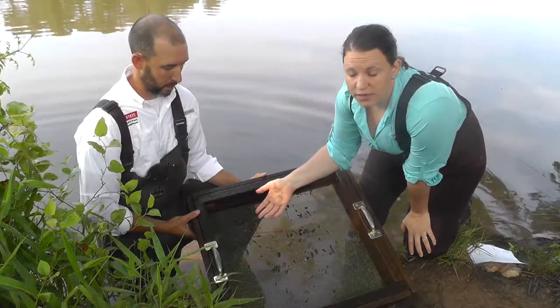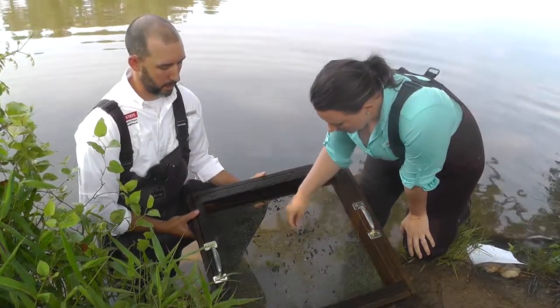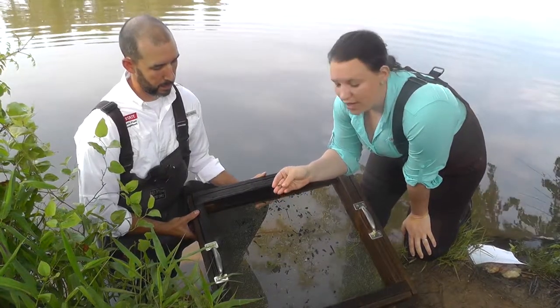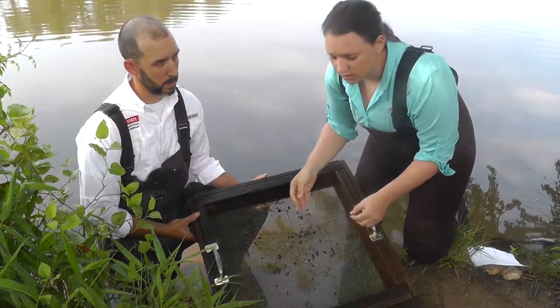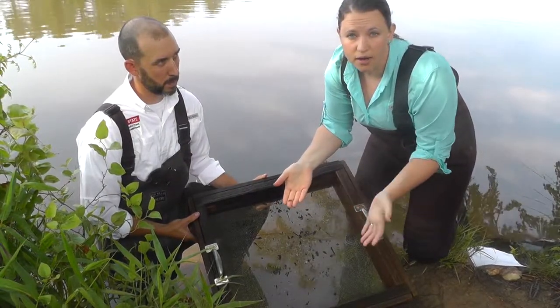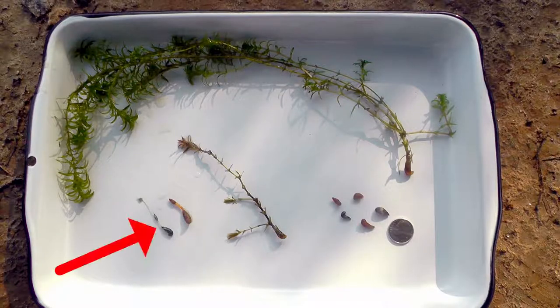Now that you've sieved through your sediment core, you can look for tubers. What you want to look for are these sweet potato-shaped objects — they can come in a variety of colors and sizes. This here is a brown one and one of a relatively larger size. Here's an example of a tuber that has already begun sprouting.